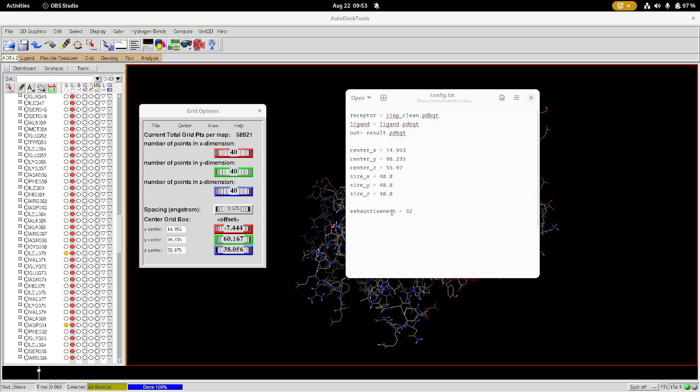And then finally at the bottom here we have exhaustiveness. This is a setting for how hard AutoDock Vina is going to search for the best confirmation, and the maximum value that you can set it to is 32. So I've got it set to the maximum so that we can definitely find the best pose.